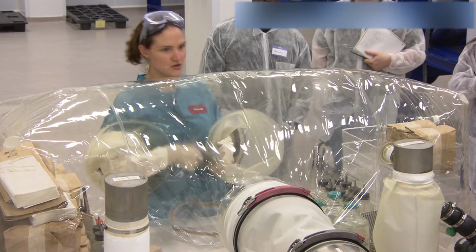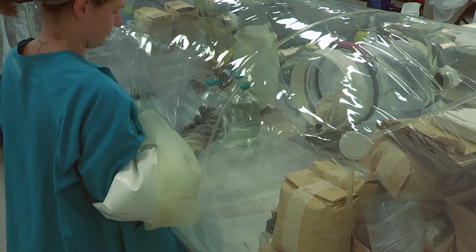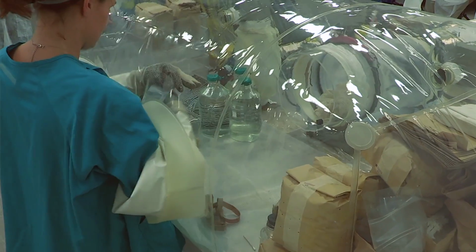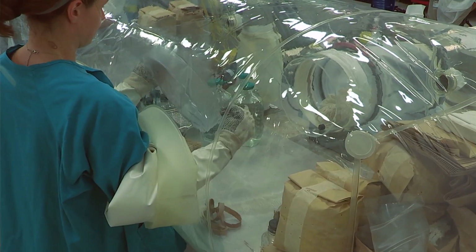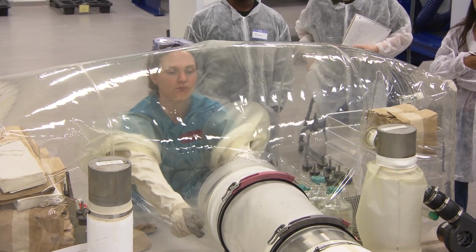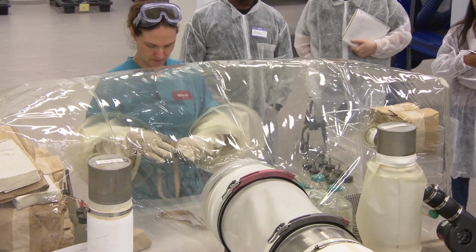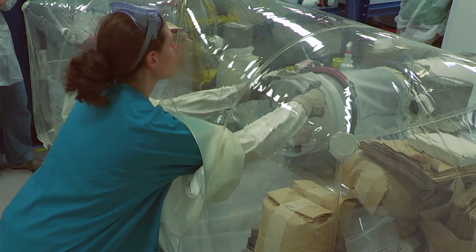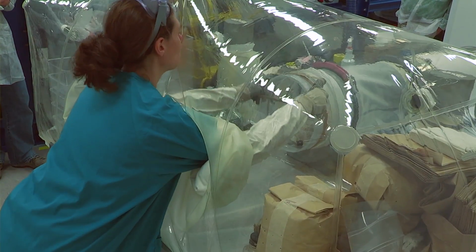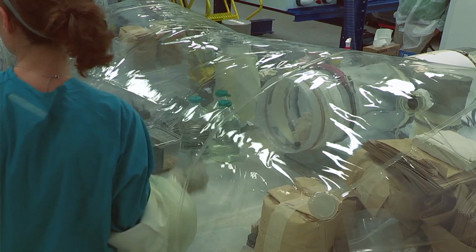And you want to try to get it all out now, so you're not doing multiple entries in and out. So try to keep this to a minimum. And then again, I just check my cap, but because my cap's off again, just out of habit, I check it again. You never know. So now we should have our isolator fully stocked with supplies and ready to receive animals.